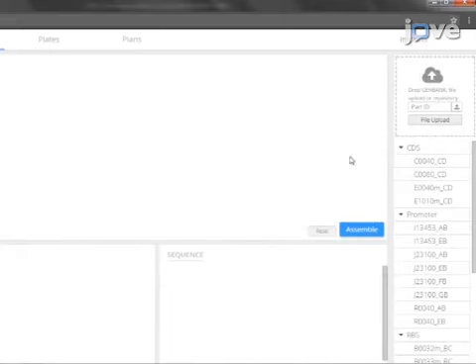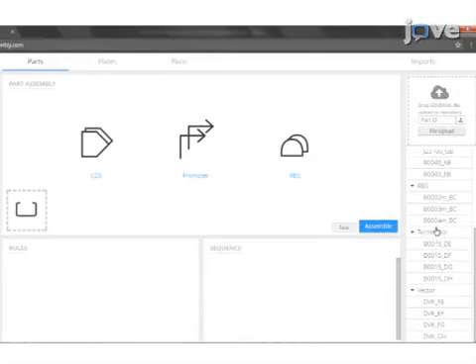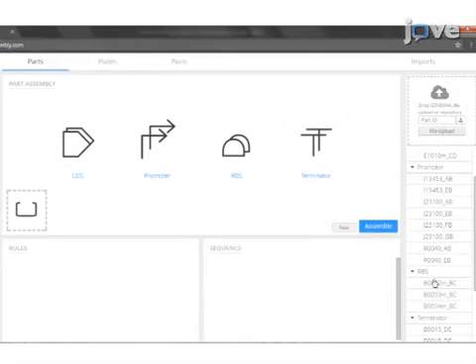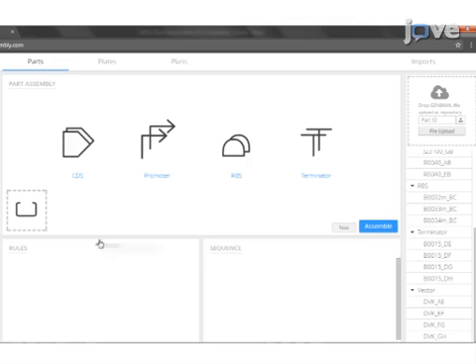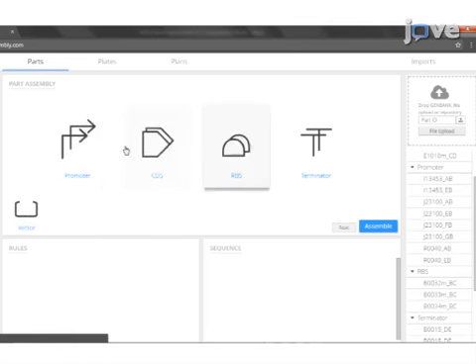Once all the files have been uploaded, select the desired DNA parts. Collections of parts as well as individual parts can be selected. Drag the parts onto the blank canvas. Order DNA parts such that the 5' and 3' overhangs for each part match. Place part types in the intended final order of DNA parts.